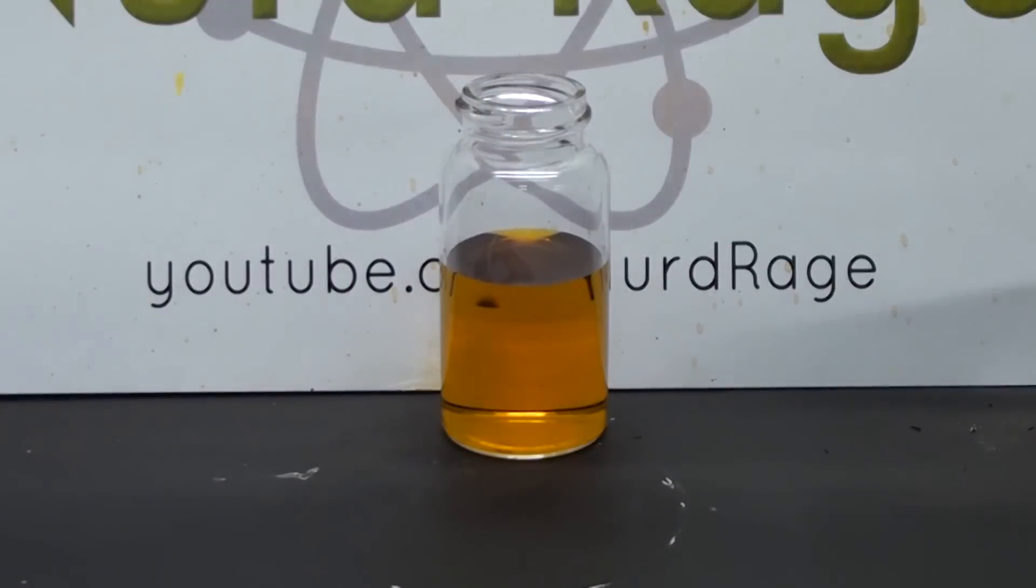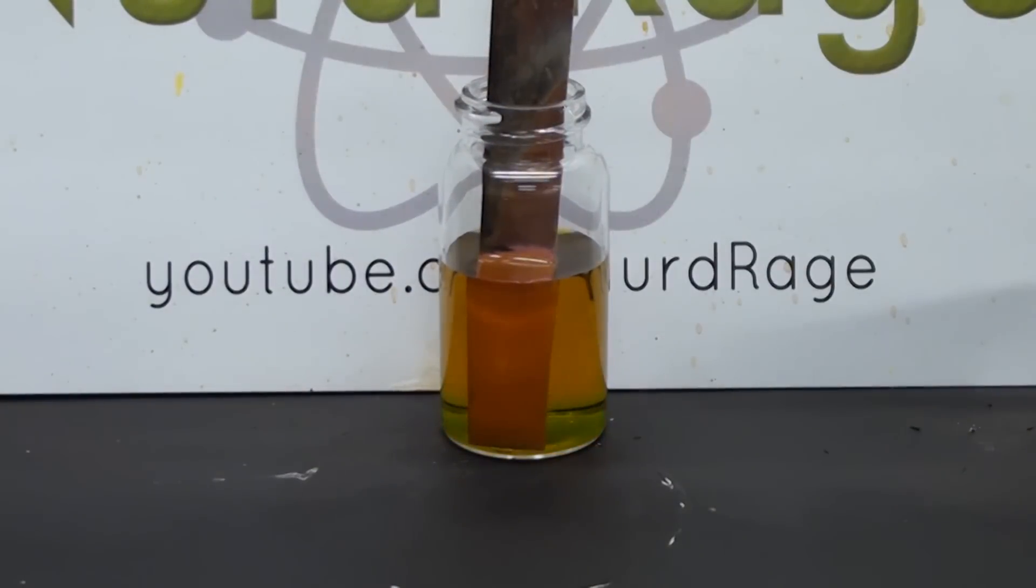Greetings fellow nerds. I've gotten a lot of requests for this so in this video we're going to make ferric chloride, a useful chemical to etch copper clad printed circuit boards.